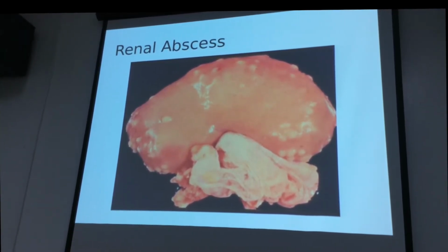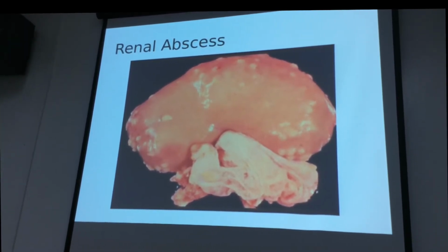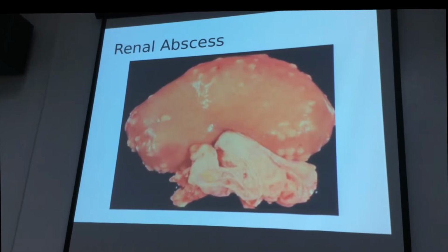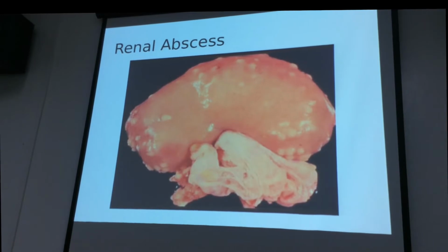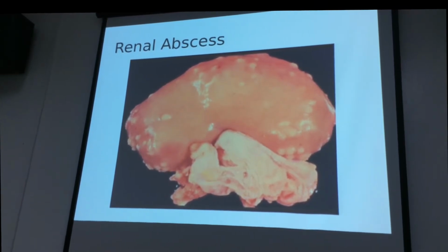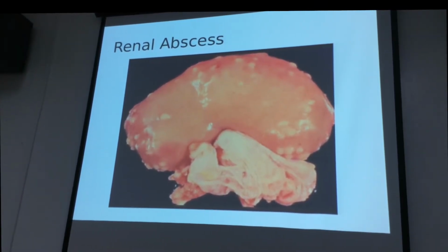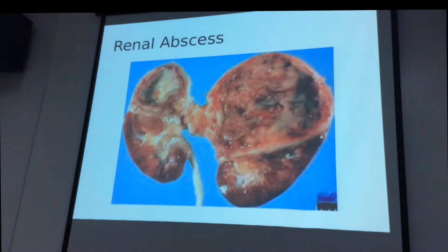But in acute cases, you can readily peel the capsule off. And you will also observe that the external surface of the kidney will be very, very smooth. Unlike in cases of chronic renal diseases wherein there will be areas of scar formation. And in those areas, there's a chance that the renal capsule will stick, or you will have a hard time tearing it off from its adherent surface. Now inside, when you cut longitudinally through your kidneys, you will see this focus of pus collection.